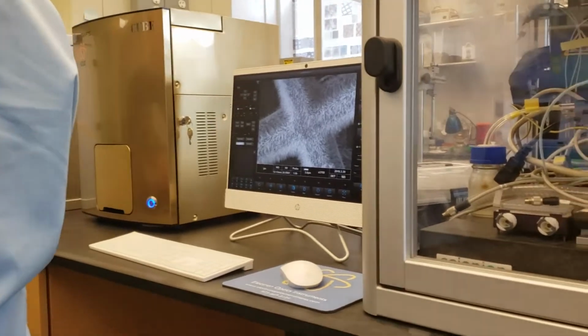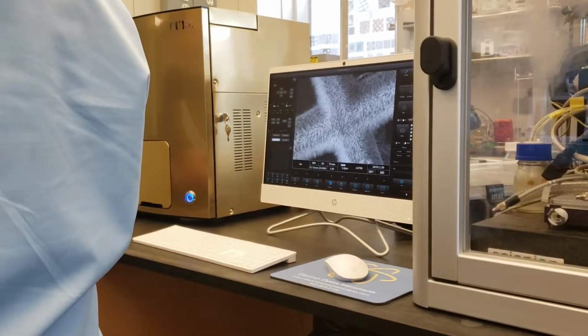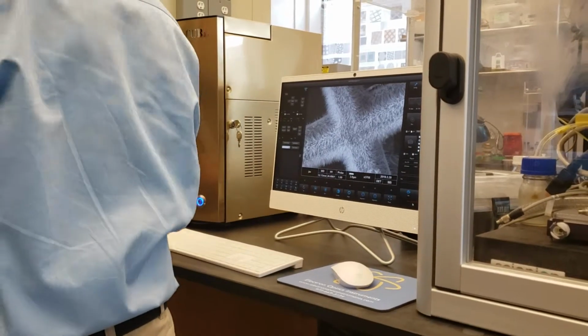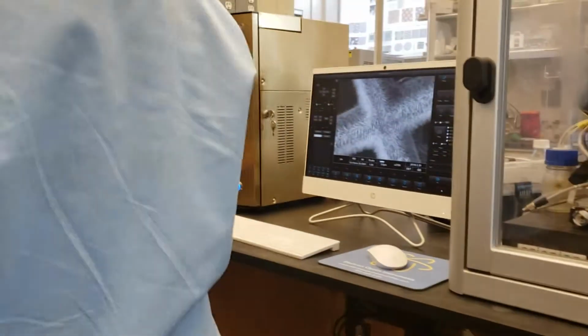It'll overheat. Depending on use, I think you probably can keep this on. For instance, if you know you're not going to use it over the weekend, just kill the program, power off, done. And I'm going to go over that with you guys as well. I'm just waiting for this to pump down. We're waiting that 4 minutes now.